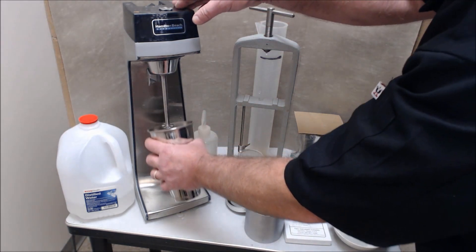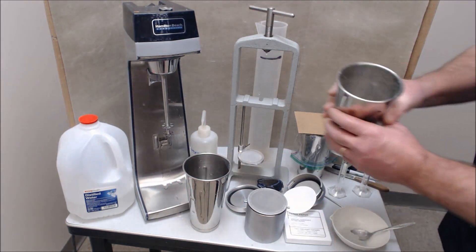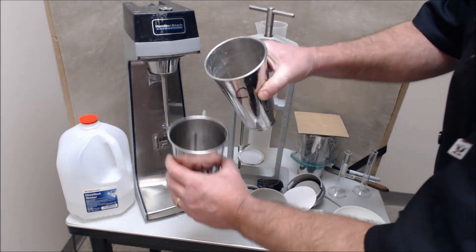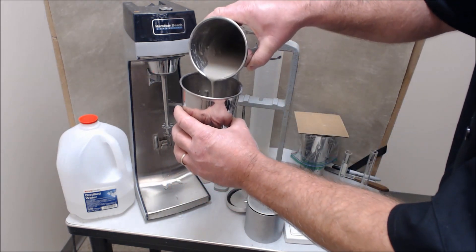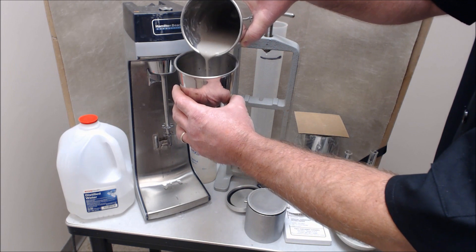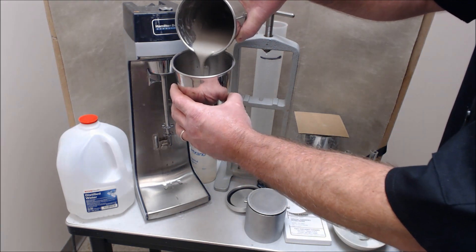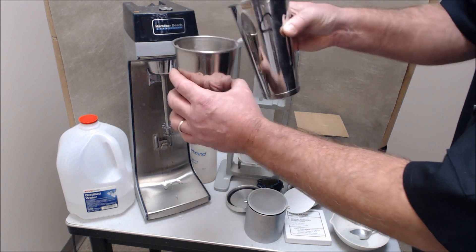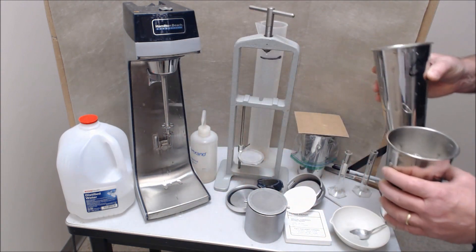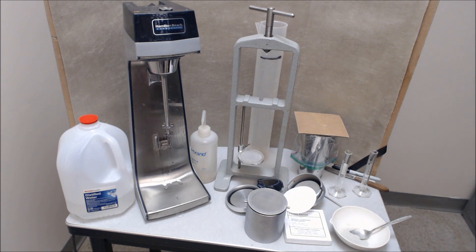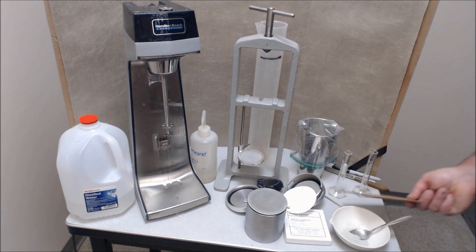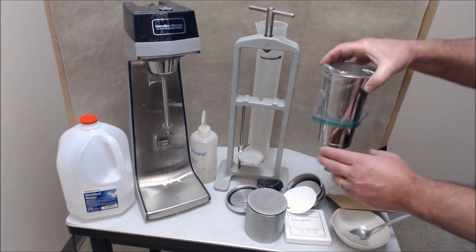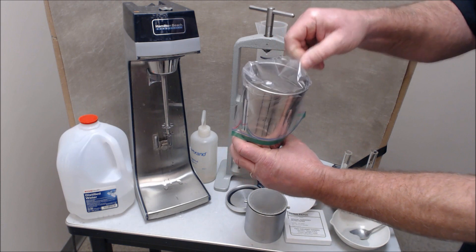Over time, it will look like this gel. I prepared this in advance and there you see it. There's the type of gel that you'll experience when you mix this up. It has to be mixed quite a bit better than this, it's just for demonstration. You then take that material and let it sit overnight. You cover it and this is what it looks like.